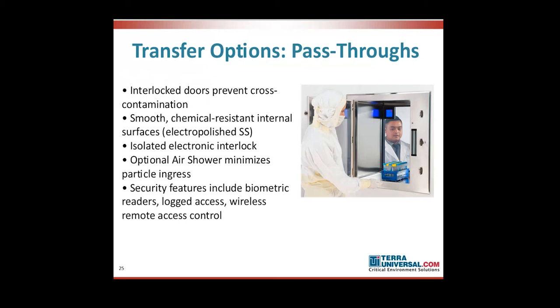Yes, my understanding is that carts should not be moved back and forth between the ante and buffer area. I think this is a rule of thumb that dates way back and has been addressed in USP 797. The idea is we don't want to violate that boundary cleanliness layer that we established between the ante and buffer area.